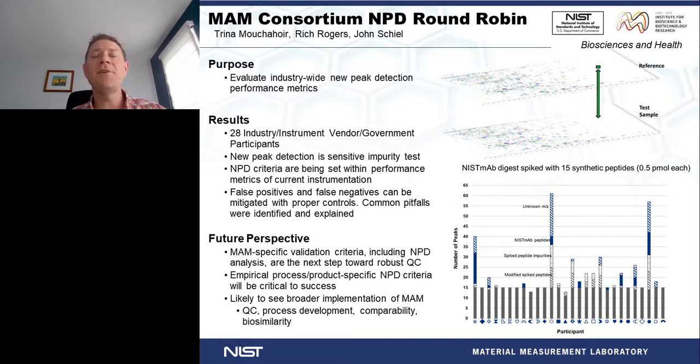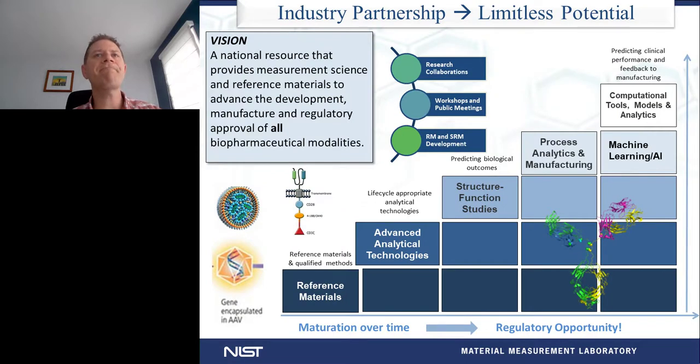So really, the future perspective of MAM, I think, is a very bright potential for an analytical assay. There will definitely be some need for additional validation criteria, very good system suitability controls, but we really do believe that this analytical method has a bright future, and we'll start to see a more broad implementation of this throughout the drug development lifecycle.